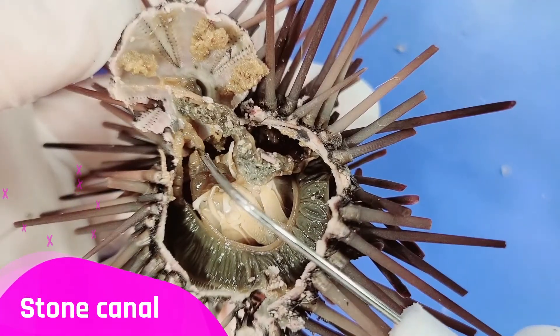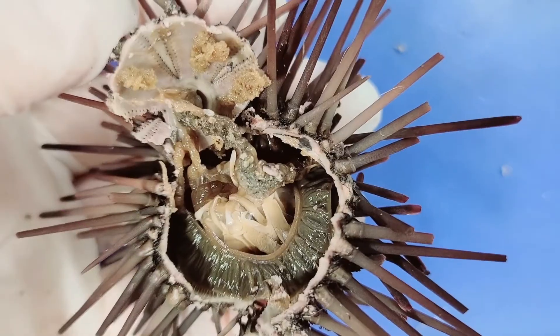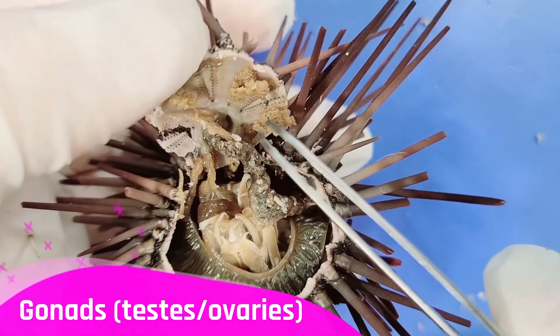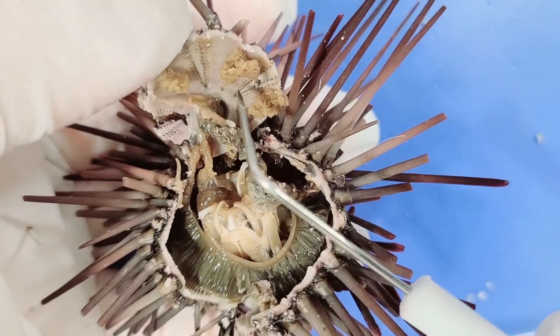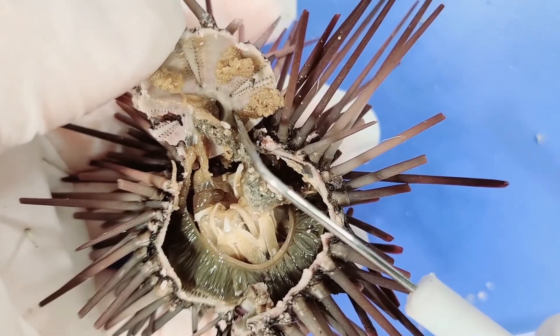Here you can see the intact stone canal, which leads into the ring canal that wraps around the esophagus. The gonads lead right into the gonophores — the openings where sperm or eggs would be released — one gonophore for each gonad.